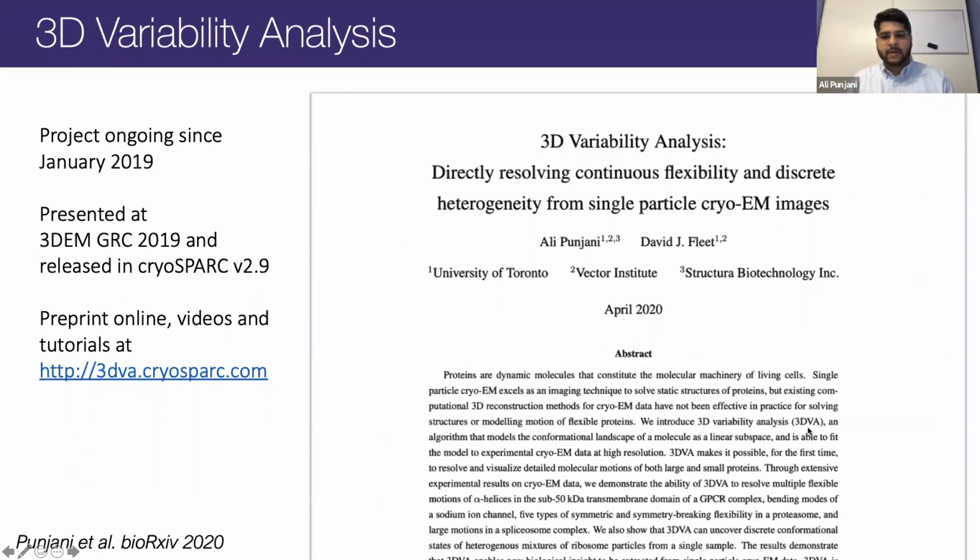So I'm very happy today to be talking to you about 3D variability analysis, which is an exciting research project that has been ongoing for some time, since early 2019. It was presented last year at the 3D Electron Microscopy Gordon Conference, and it has since then been released in cryoSPARC version 2.9, and many groups have already been experimenting with it and using it. Recently, we had a chance to get out a preprint describing the method, as well as the algorithm and the results in more detail, along with some tutorials for how to use it in practice. Today's presentation will cover all of that in hopefully a good amount of detail.